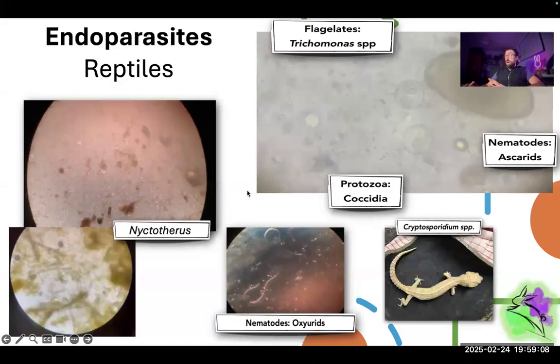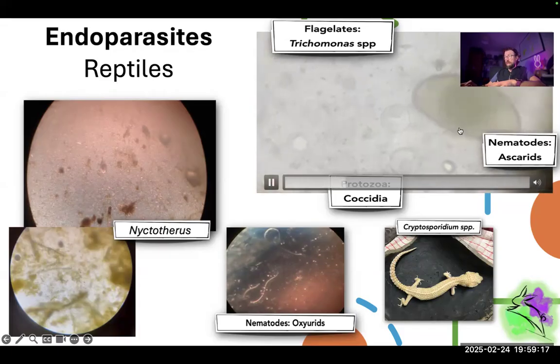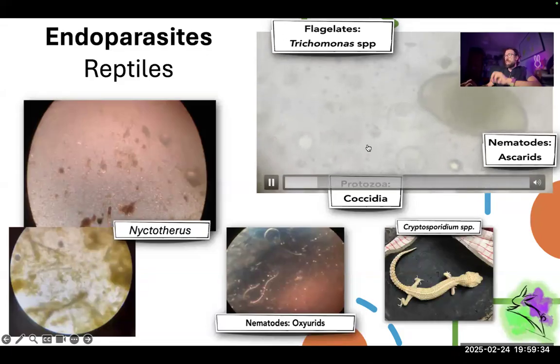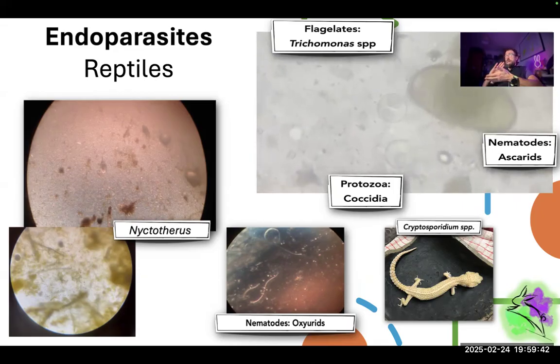Sometimes we can also have a few parasites present at the same time. Like in this case, the bigger one is an ascarid egg. Then we have the rounded one in the middle, and the bottom one, which are coccidia. And I think that you can see there are teeny tiny ghosts, very tiny parasites that are floating around, and these are flagellates. And this highlights how important it is to check the feces, because these three different parasites have respectively three different treatments.